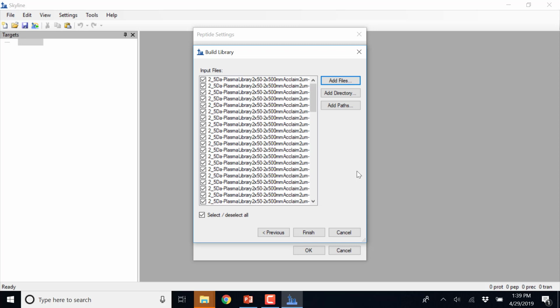If you keep clicking through the folder, like if it's zipped up in a folder, you can select the directory, or you can go in and select all the files depending on what option you chose.